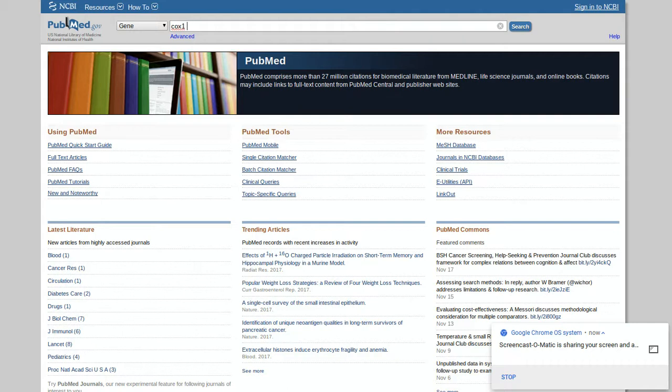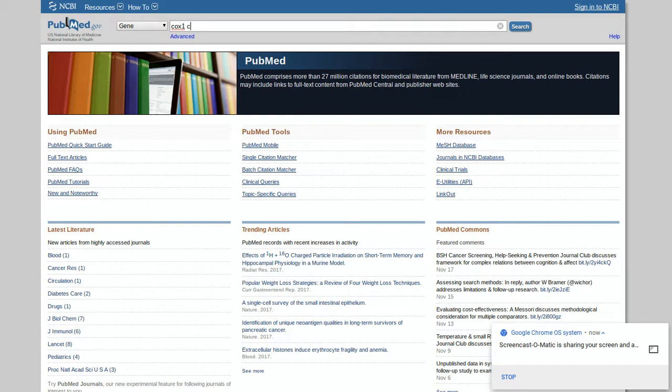Following that gene, you type in the genus of the species. So let's say it's a dog. The genus level dog is Canis, so you'll type in C-A-N-I-S. And then just click search. And there you go.